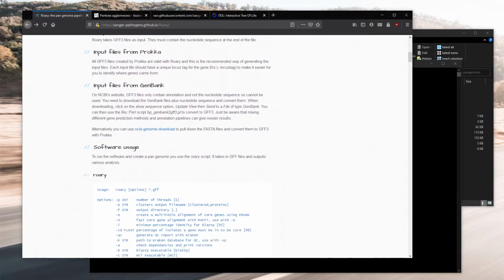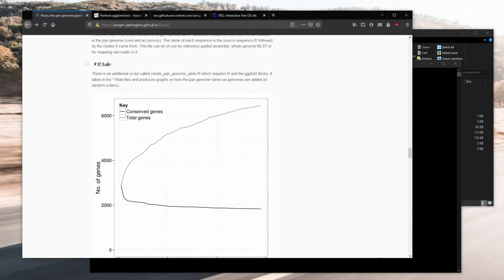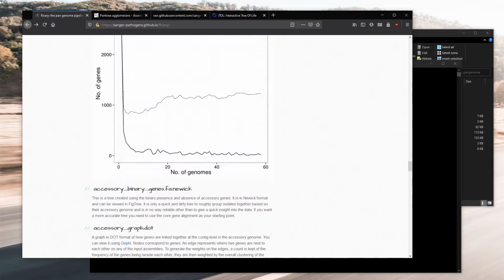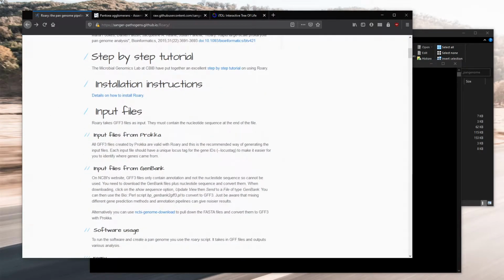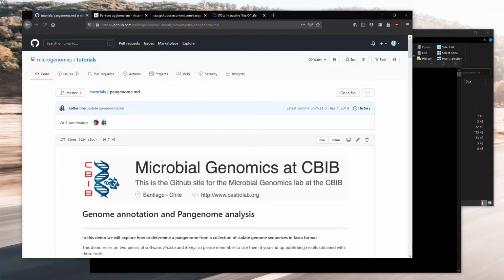And I think there's a lot of troubleshooting stuff at the bottom too. So if you have issues, they might be worth going down here and figuring out. Maybe they already answered your question about what is going on. Anyway, so let's go to a step-by-step tutorial.